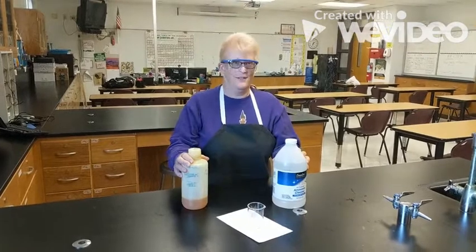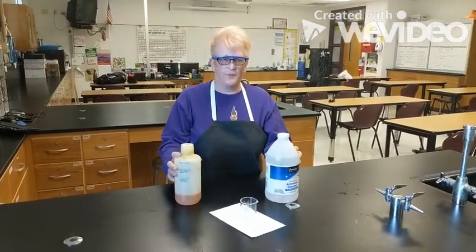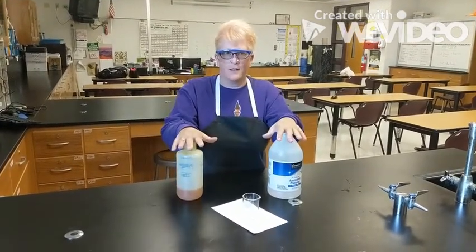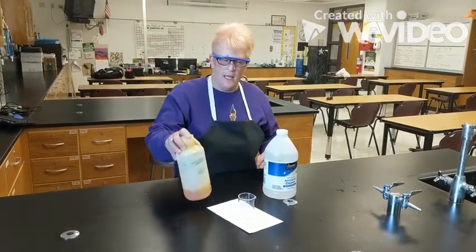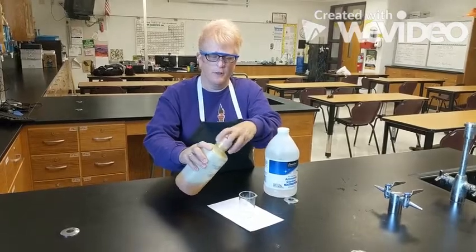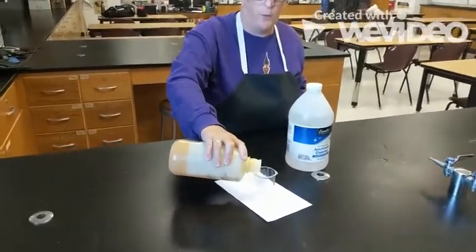Hello and welcome to station number 5, the last station. So we have 2 reactants here, and one of them is iron 3 chloride, and I'll pour it into the beaker. It'll give you a little bit better view for what it looks like.